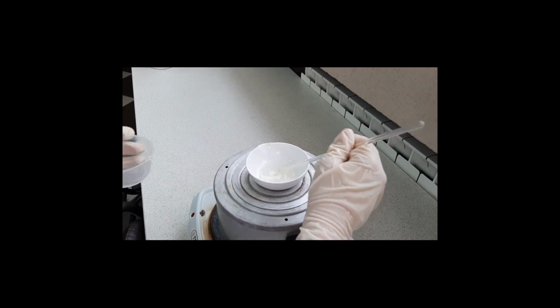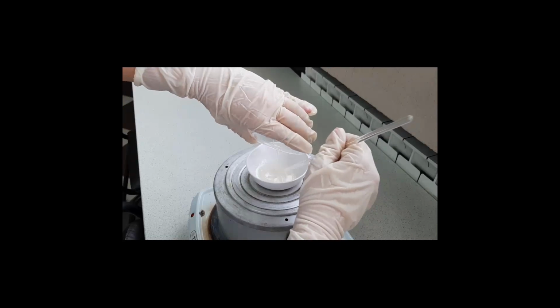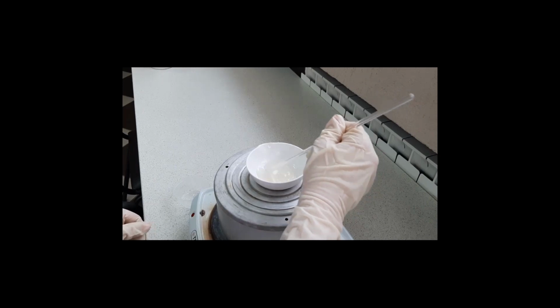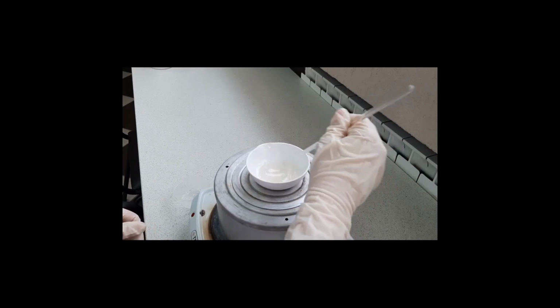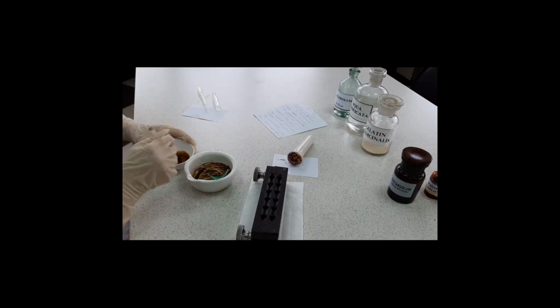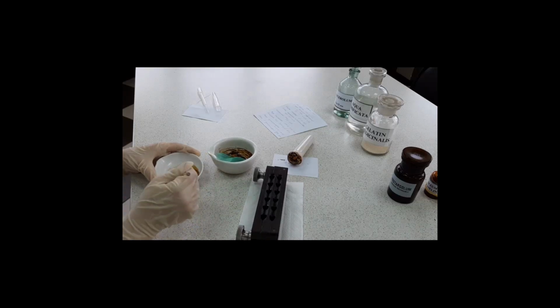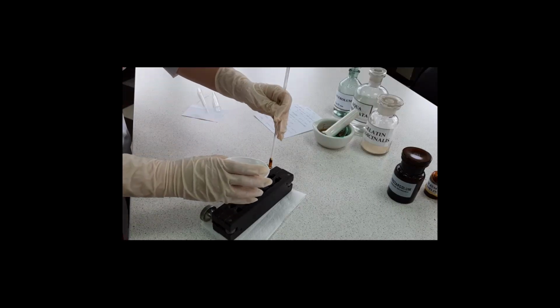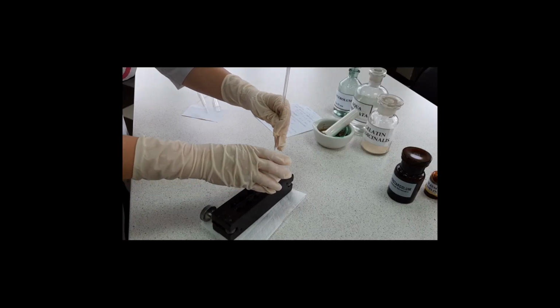After swelling, heat the gelatin on a water bath and add glycerin. Mix until homogeneous. Transfer the protargol solution to the gelatin-glycerol mass in a porcelain cup and mix until homogeneous. Pour the suppository mass into the mold cells.